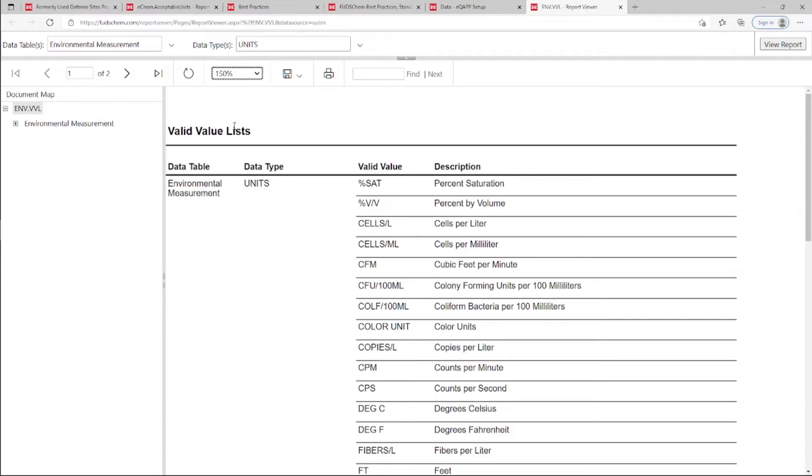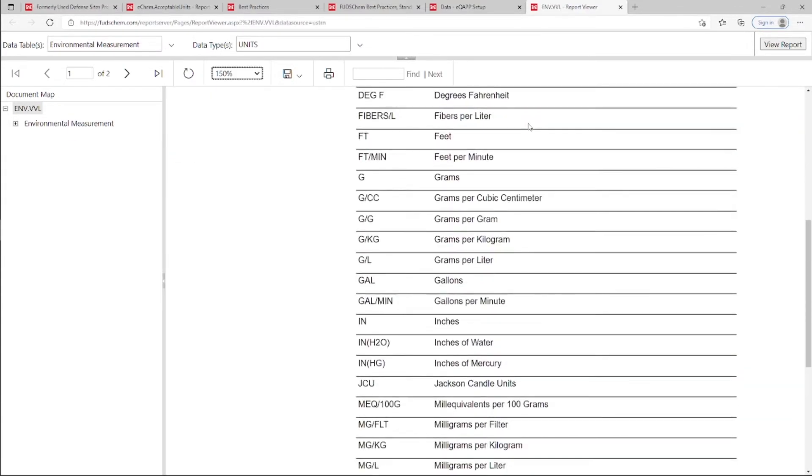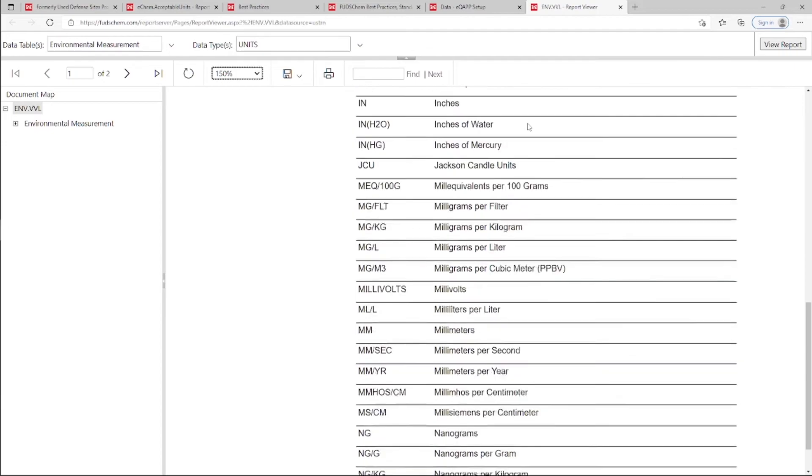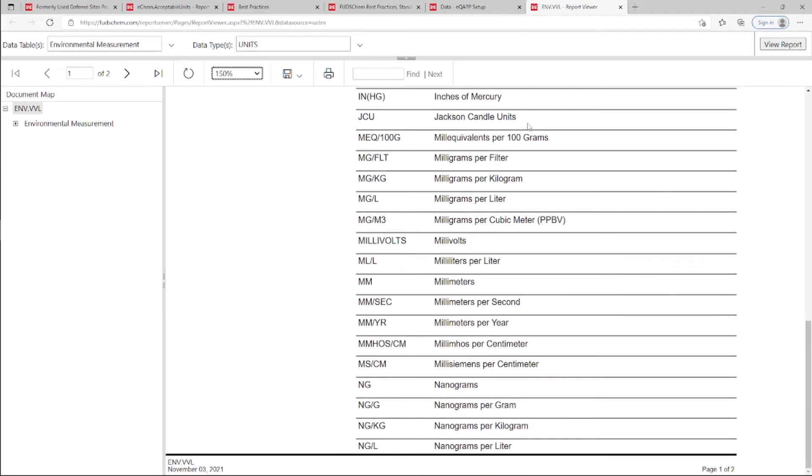We can see all of the units that are currently valid values in FUDsChem for that specific data table. If you do not see the units that you need, please reach out to your Synectic's point of contact.